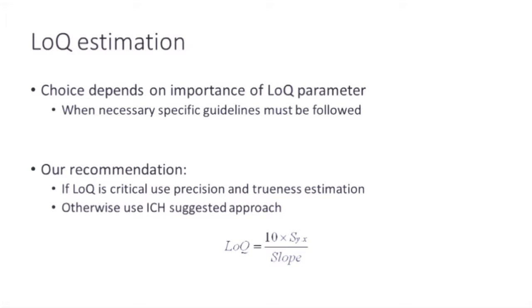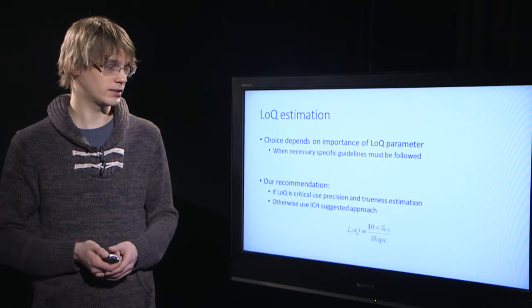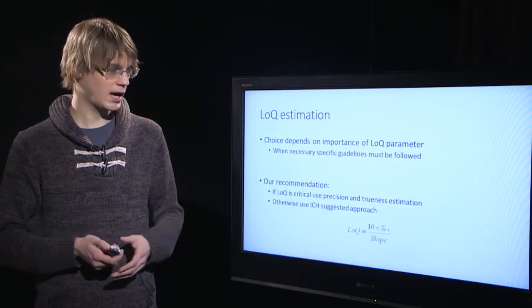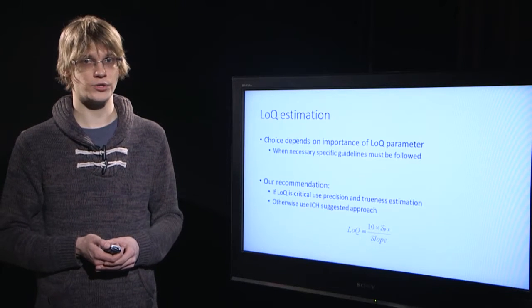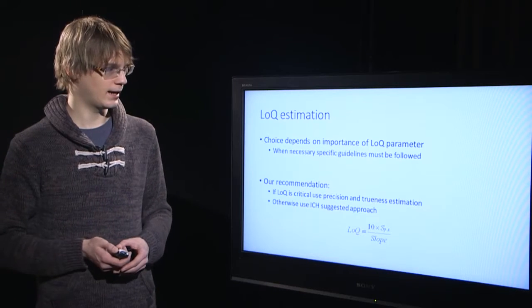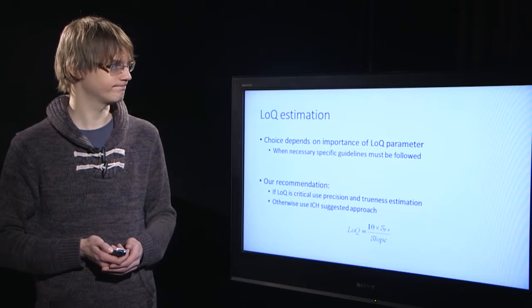However, our recommendation is that if LoQ is really critical for the analytical method, then the first group of approaches should be used so that precision and trueness are really estimated at different concentration levels. Otherwise, we suggest using the approach that is suggested by ICH, that uses the standard deviation of the residuals.